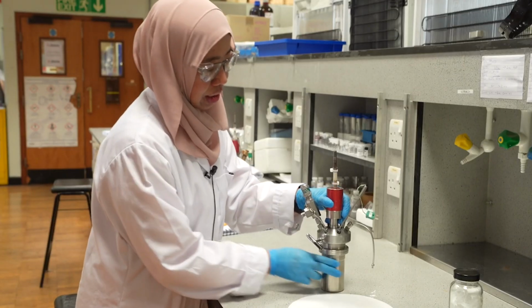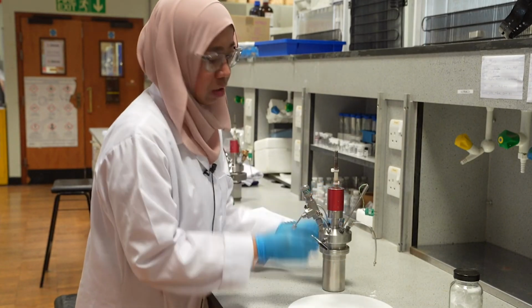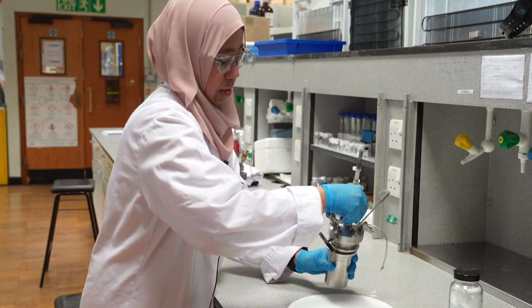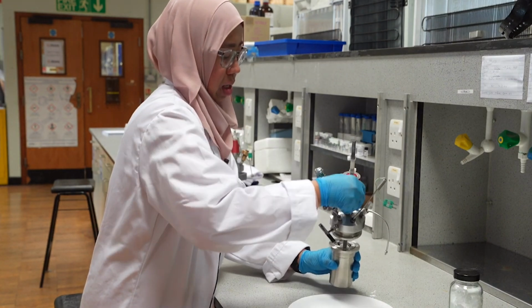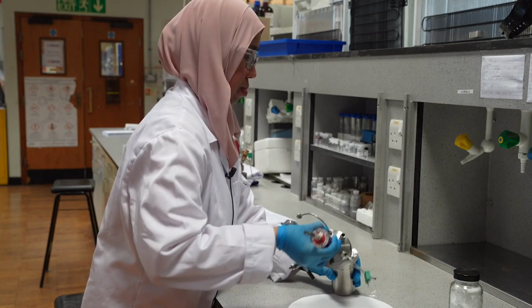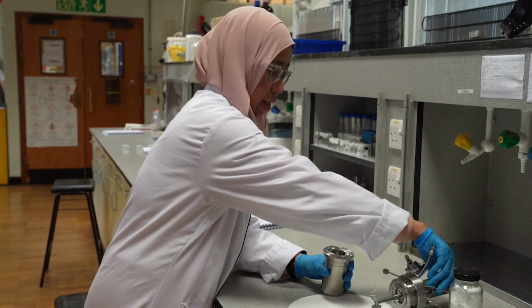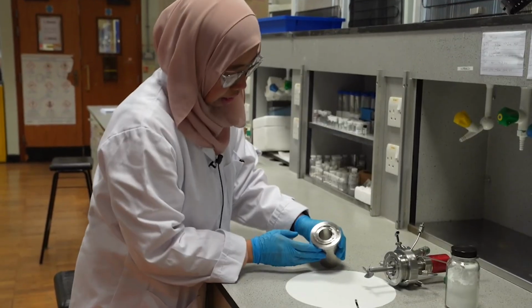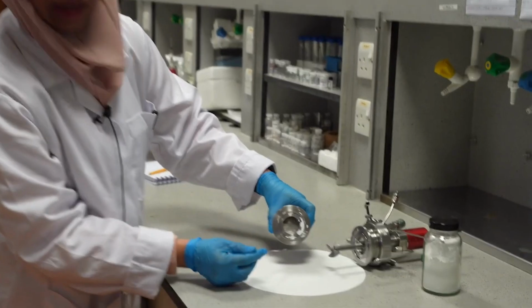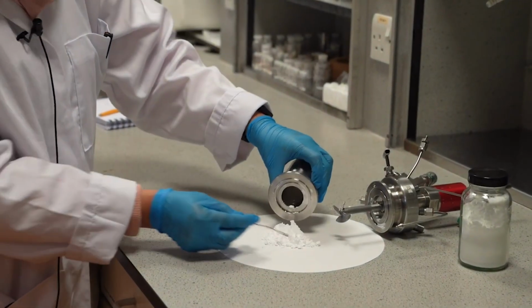So this is the detached autoclave here. We are going to see how the product turned out. So we open the autoclave head, and then this is how the product looks. Yeah, this is the PMMA, the polymethyl methacrylate polymer.